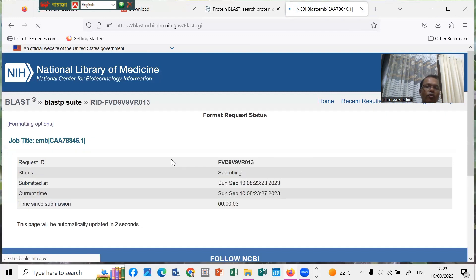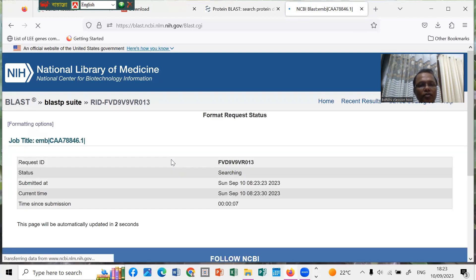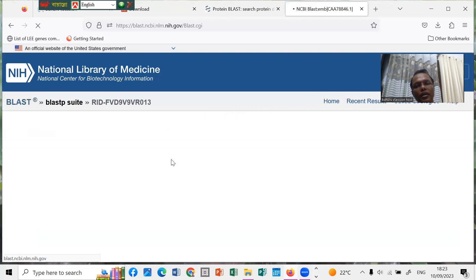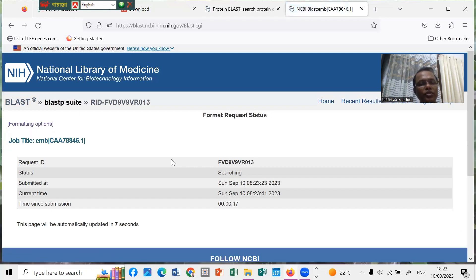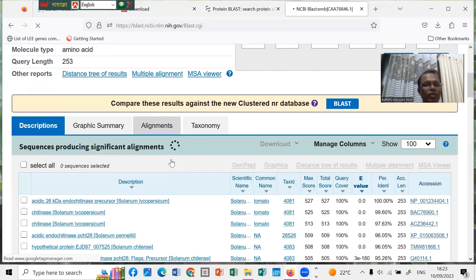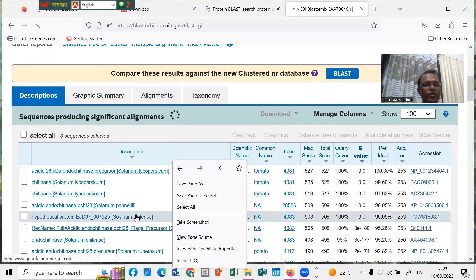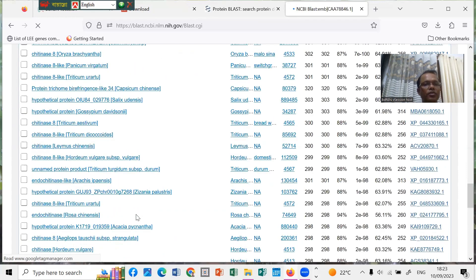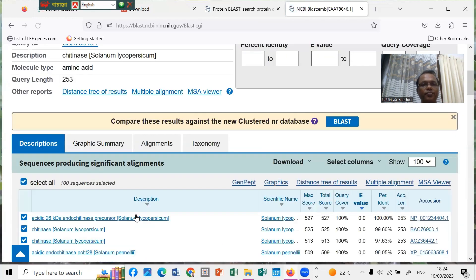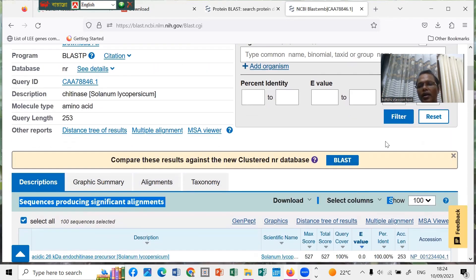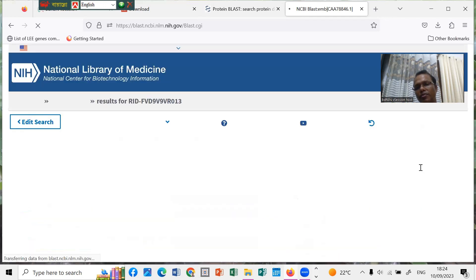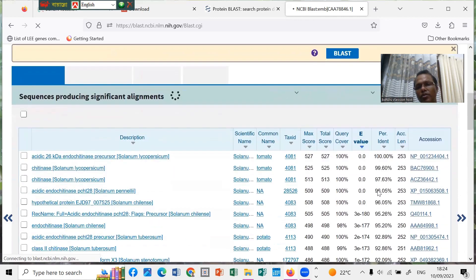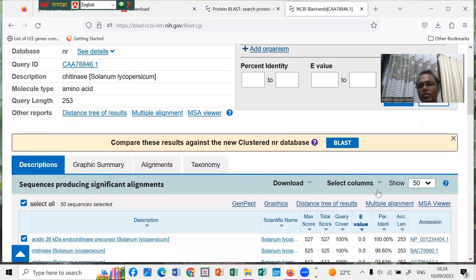From here, this BLAST. Please wait a moment, BLAST is searching. It always searches a few seconds, updating again and again until the searching is finished. You have to wait and see. Now you can see we already got the 100 homologous sequences here. On the left side you can see description, graphics, alignment. The right side you can see 100 sequences. This is very loaded, so I can check 50. We can see the 50 sequences.